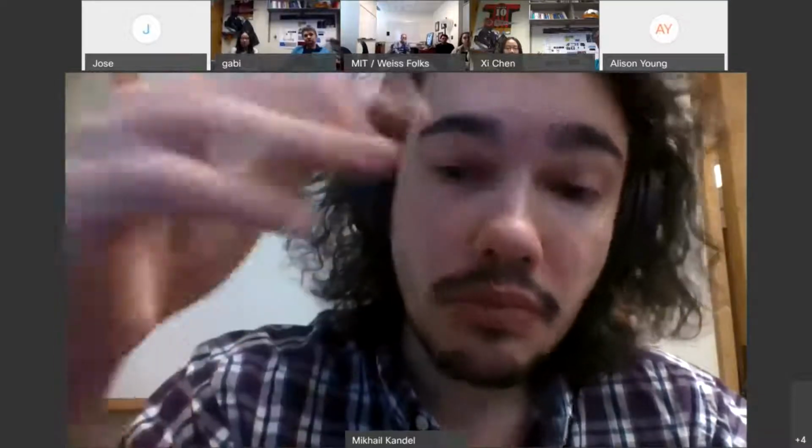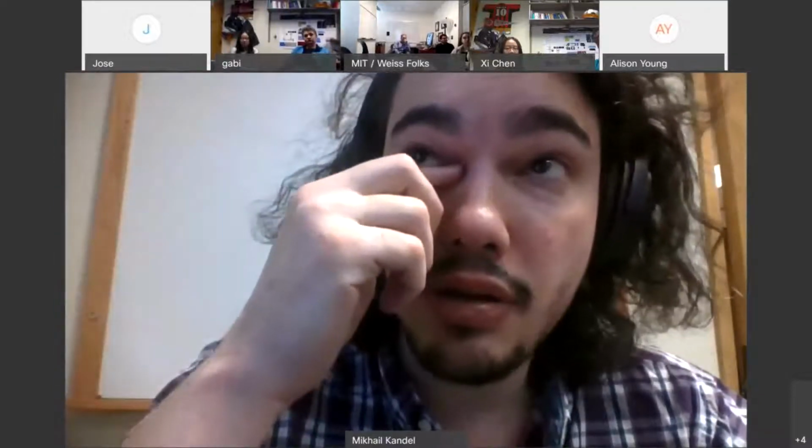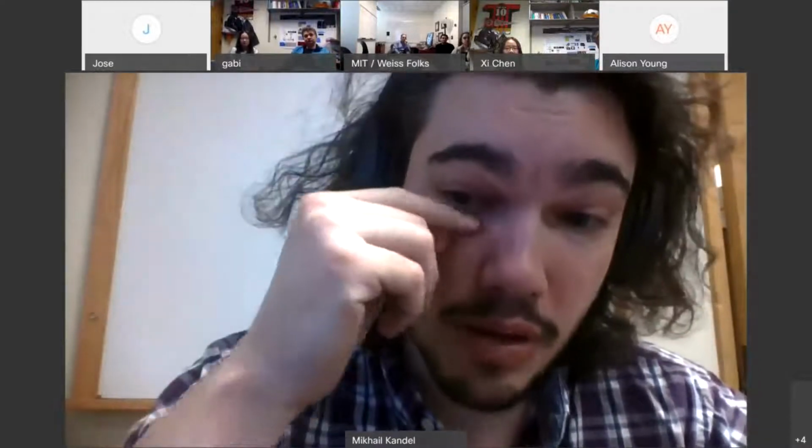Okay. I'm here to talk about the work that we've been recently doing on digital staining. I'm going to start with a little bit about the motivation for our work, and then talk about how it applies to 3D cellular systems and organoids. As you folks know, we build these wacky microscopes that are label free.